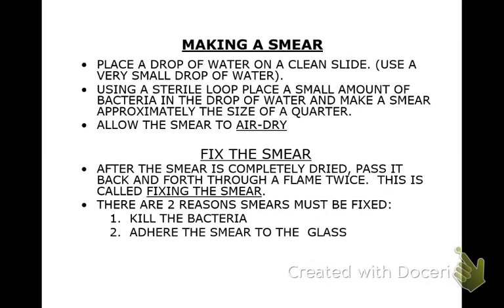Okay, then you're going to fix the smear. And all that means is after you've made it and it's dry, put it through the flame, go through the flame once and then right back through it. And that's it. You don't want to hold it. And if you do hold it, you're going to charcoal it. And then you'll see brown when you look at it. But the reason you fix it is two things. It's going to kill the bacteria, even though it was so fast. One, two. And it's also going to make the bacteria stick to the glass. So fixing the bacteria kills it and makes it adhere to the glass.